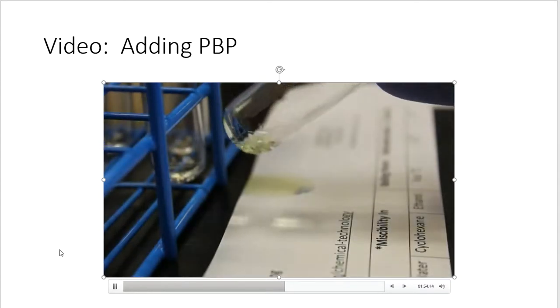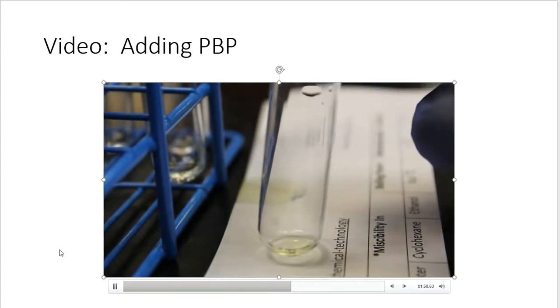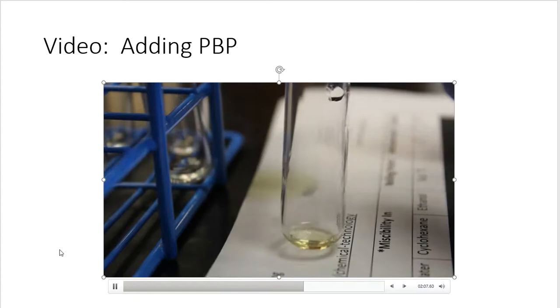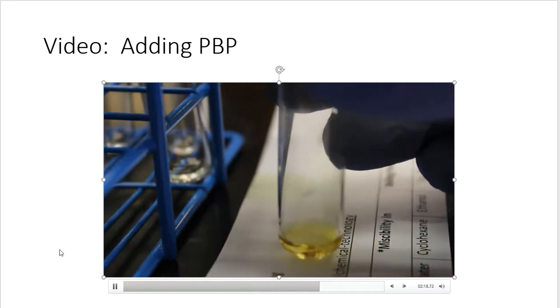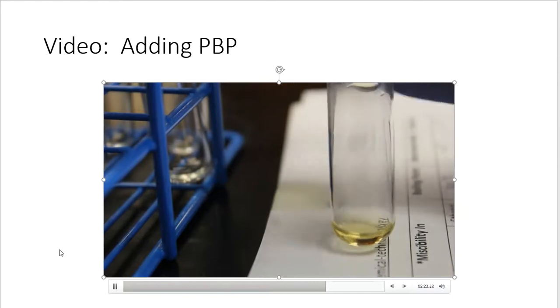All right, on to the next one. Turpentine, 2 drops. Shake. Any color, anything you see. And I'm just going to add 10 more to everything. It doesn't tell me to do that, but I'm going to. And there's 10 extra drops.